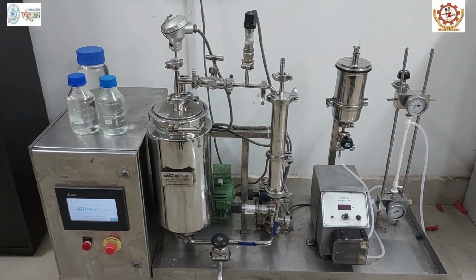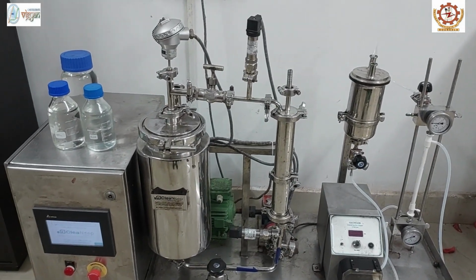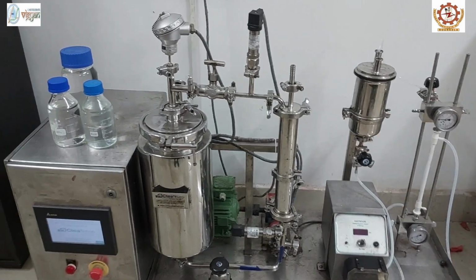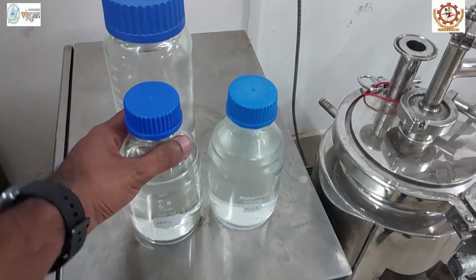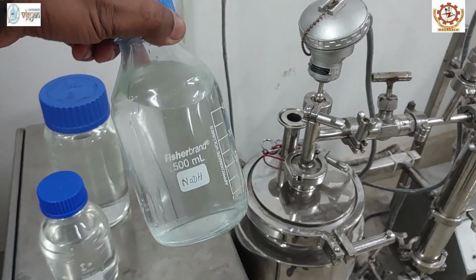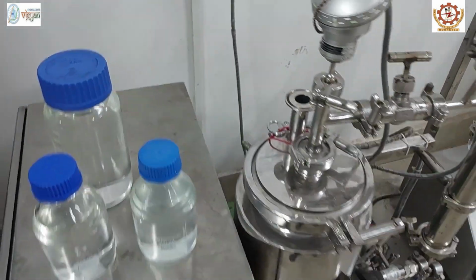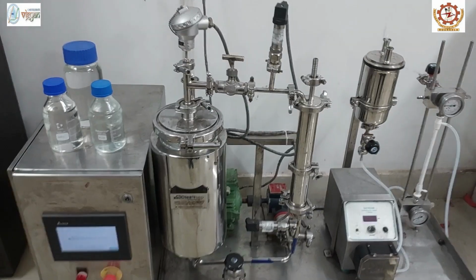So now, since the juice clarification is over, we are going to start our membrane washing procedure. For this purpose, we have already prepared chemicals: HNO3 for acid wash, NaOH solution for alkali wash, and distilled water. First, we will start with water wash.